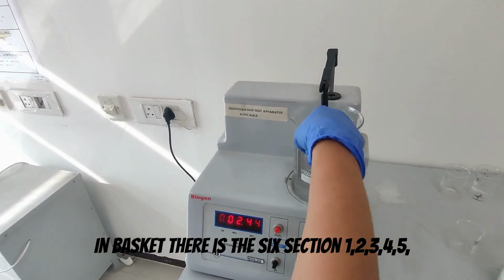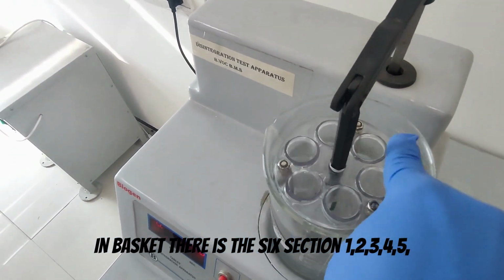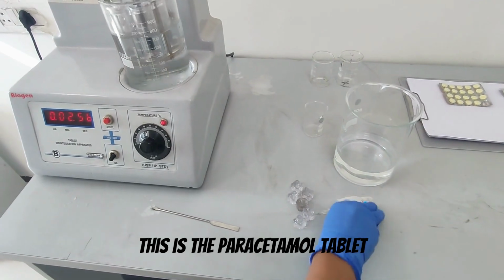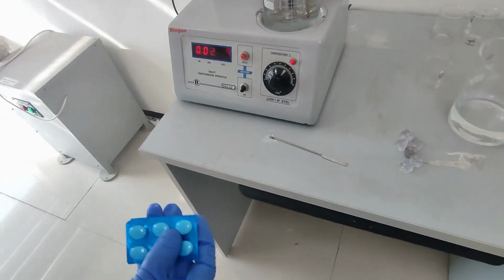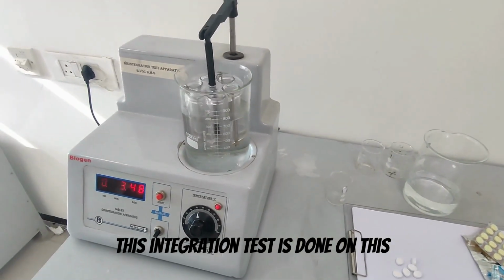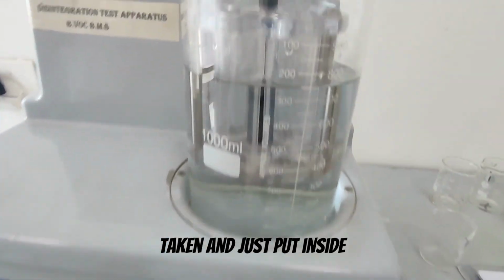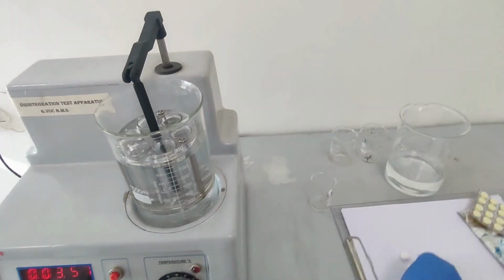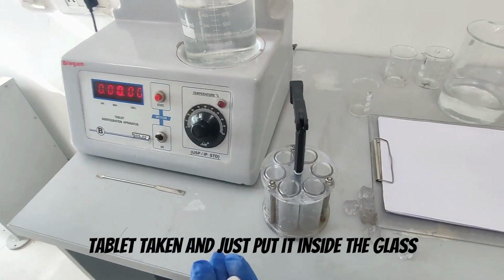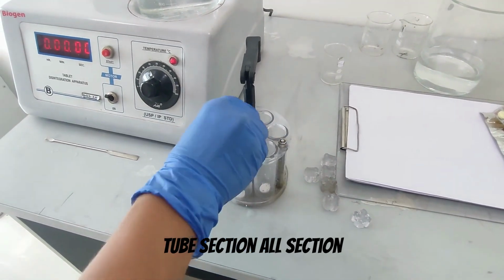In the basket there are 6 sections: 1, 2, 3, 4, 5 and 6. This is the paracetamol tablet. After compression, or preparing the tablet, this disintegration test is done on this apparatus. The tablet is taken and just put inside the glass tube section, all sections.